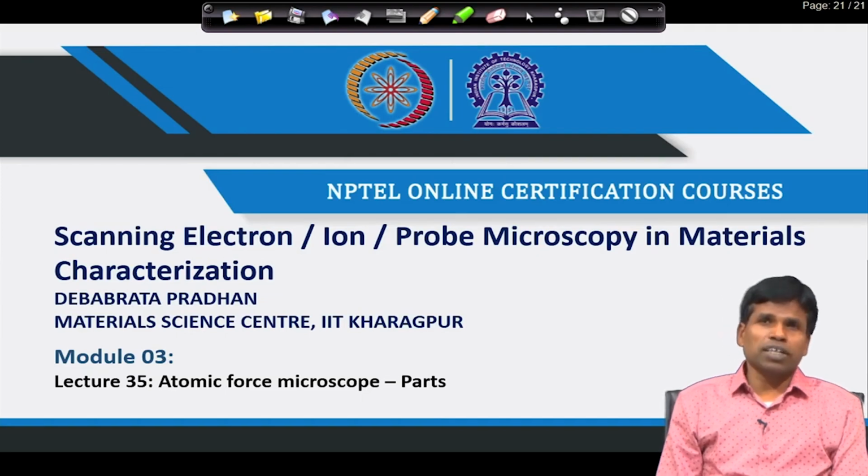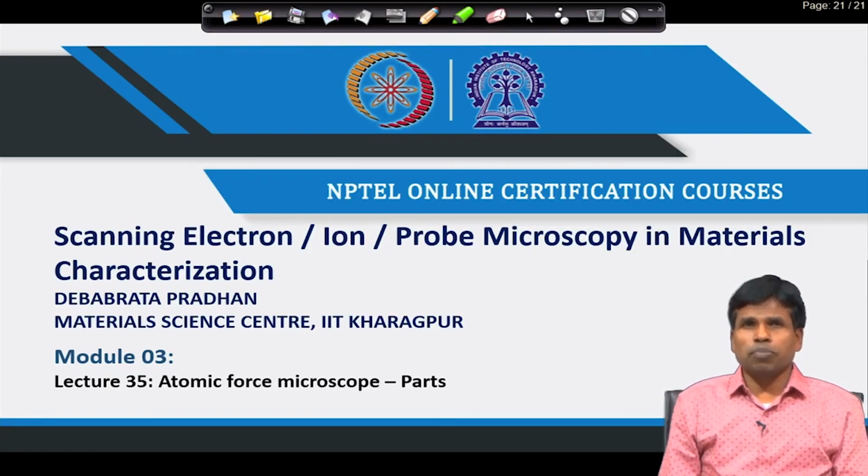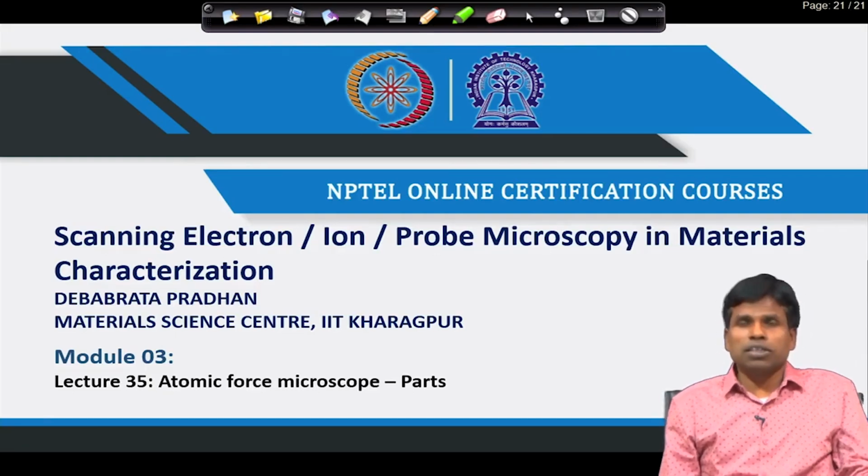Hello, welcome back. In the last two lectures, we have begun discussing the atomic force microscope. I introduced the atomic force microscope as a tool to get the topology of the sample surface through force measurements, and then I discussed a little bit about the Lennard-Jones potential curve, the attractive and repulsive forces between the tip and sample in the atomic force microscope, where a physical probe is scanned over the surface to measure the force and then to get the 3D image.